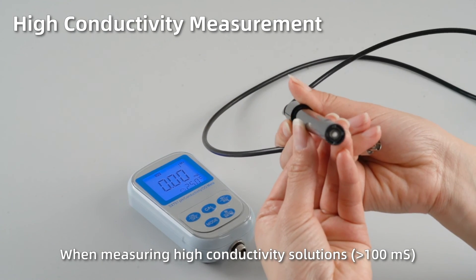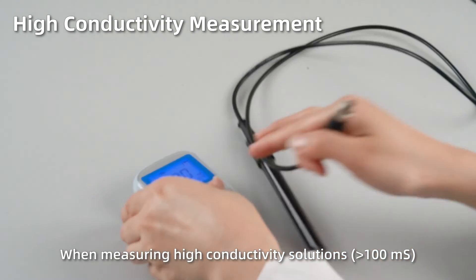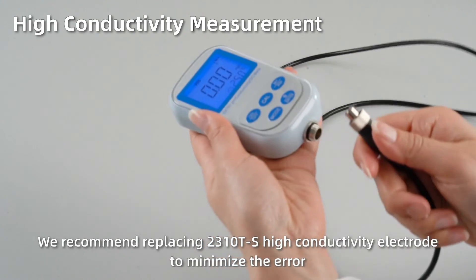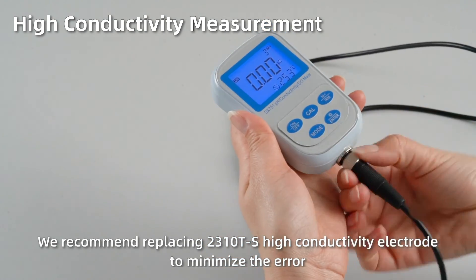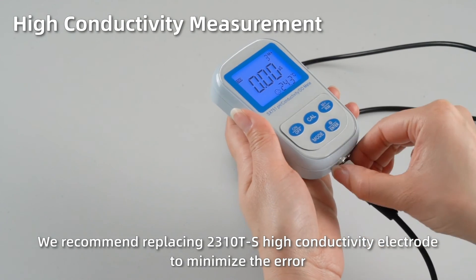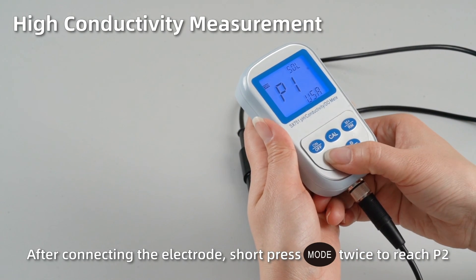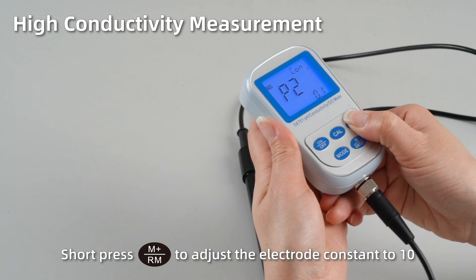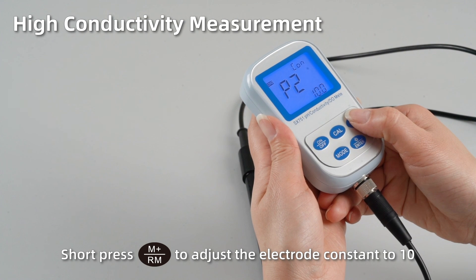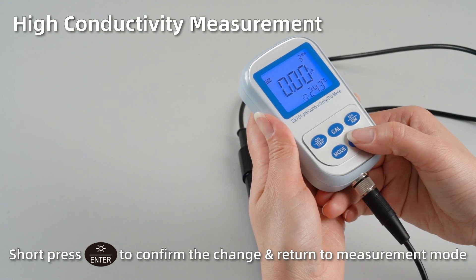High conductivity measurement. When measuring high conductivity solutions, we recommend using the 2310TS high conductivity electrode to minimize the error. After connecting the electrode, short press mode twice to reach P2. Short press M plus to adjust the electrode constant K to 10. Short press enter to confirm the change and return to measurement mode.